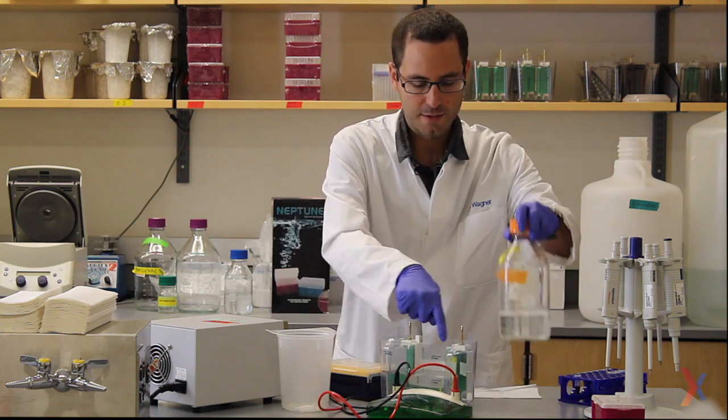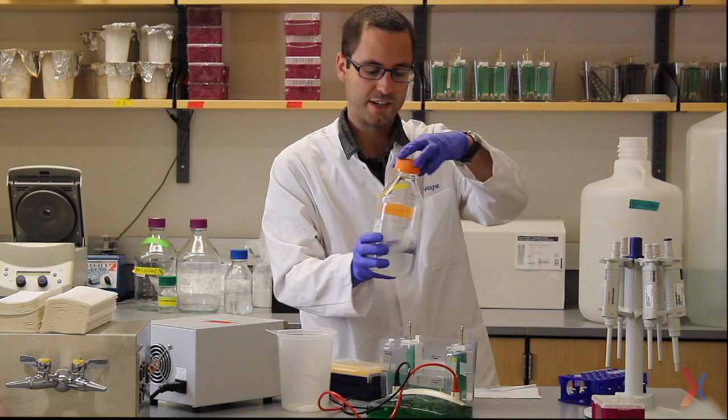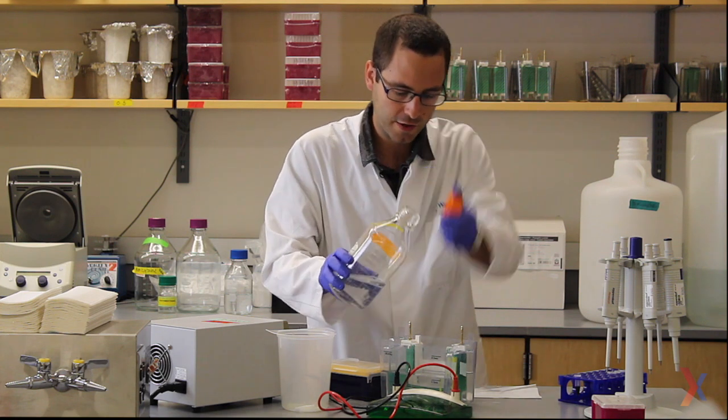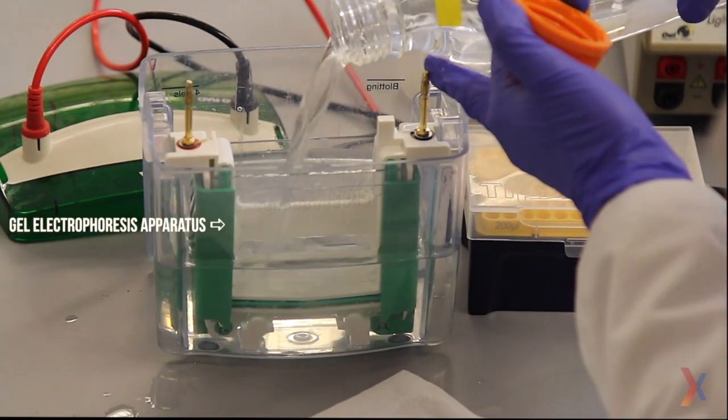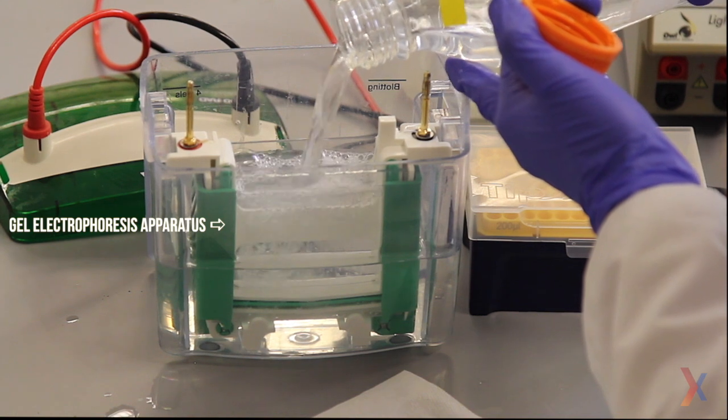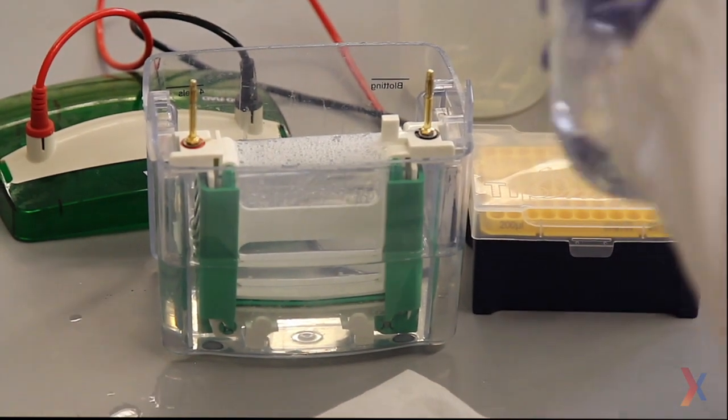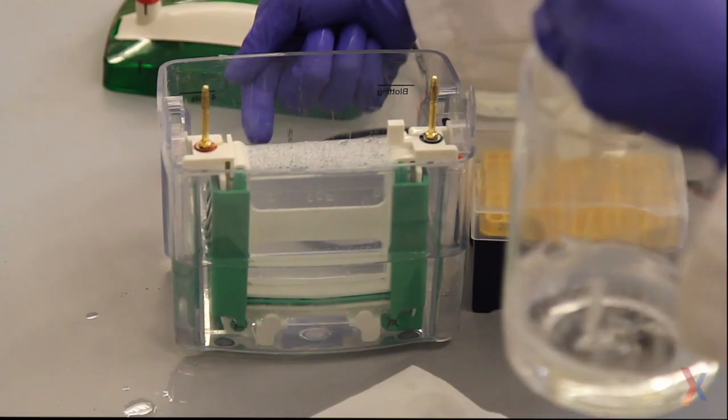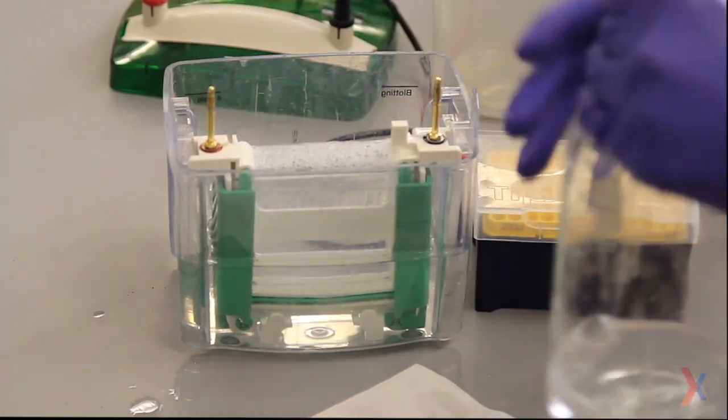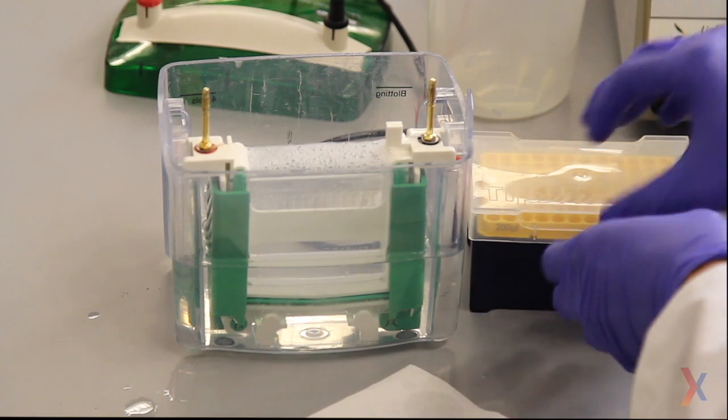The middle needs to be filled up with 1X SDS running buffer. This is now filled. There's a line on the outside here that indicates two gels. We're also above that line, so now we're good to go to load the gel.